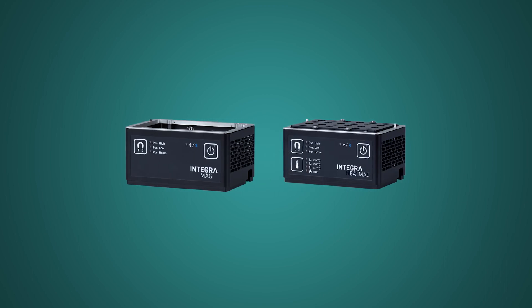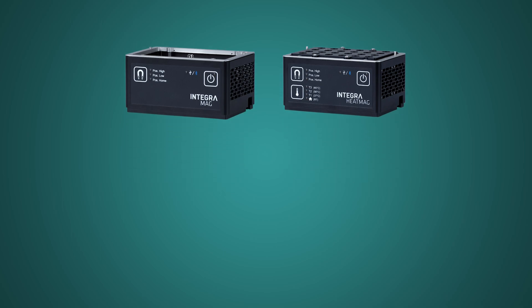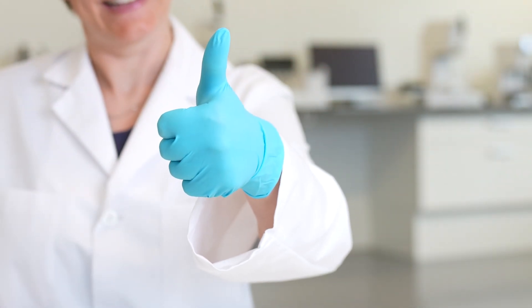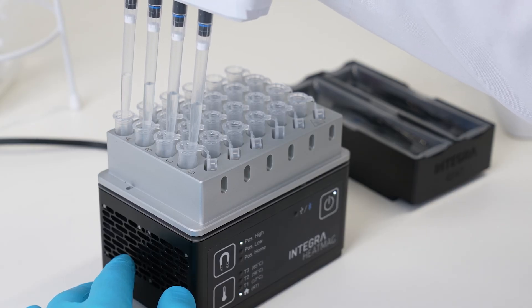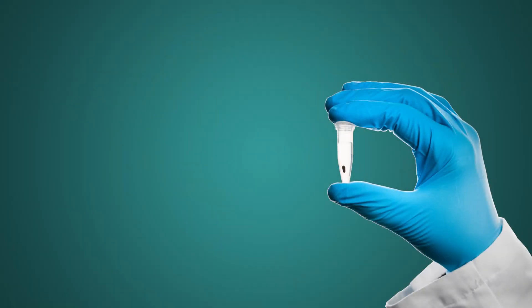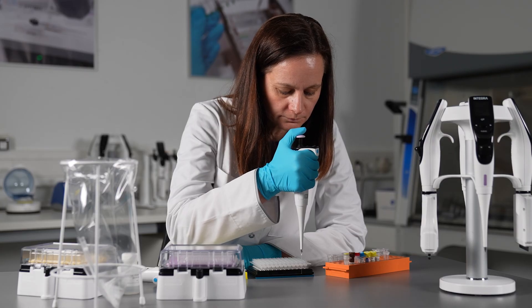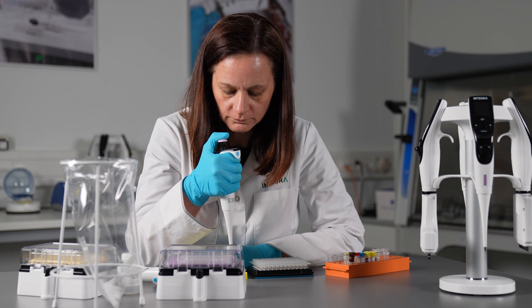Discover our latest modules reshaping the landscape of magnetic bead purifications, alongside our advanced heating, cooling, and shaking modules, all designed to simplify your workflows and amplify your outcomes. Magnetic beads are essential tools in the world of molecular biology and proteomics, enabling efficient purification of DNA, RNA, and proteins.